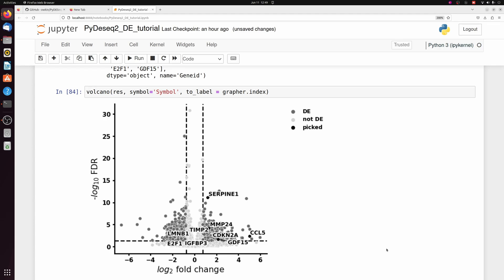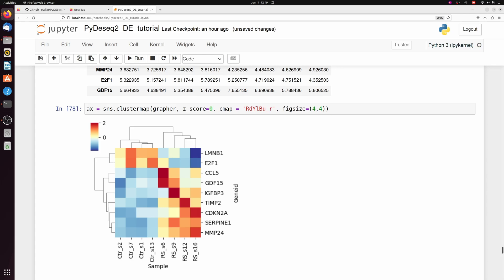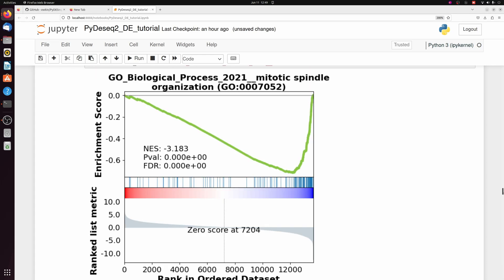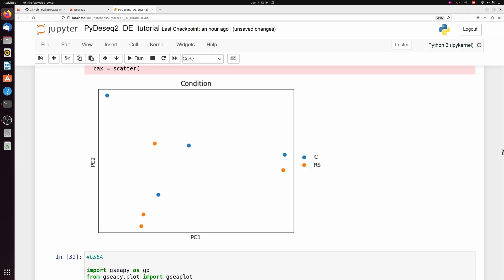Here was a basic run-through of differential expression and plotting volcano plots, heatmaps, GSEA, PCA, and it was all in Python without R.